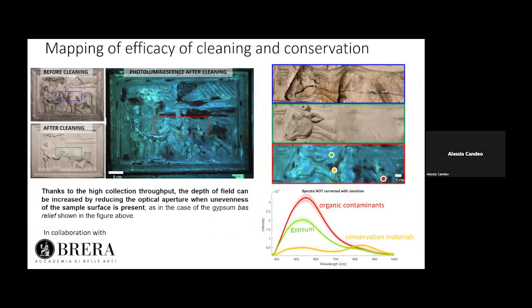We also used the camera to map the efficacy of cleaning and conservation on this bas-relief, which was monitored before and after cleaning. And it was possible, even for such a large object, to perform photoluminescence studies.